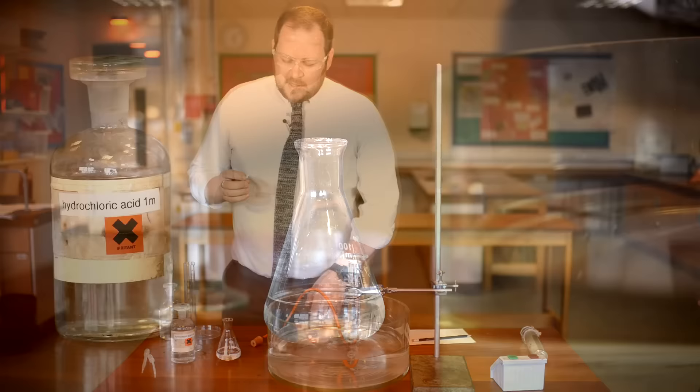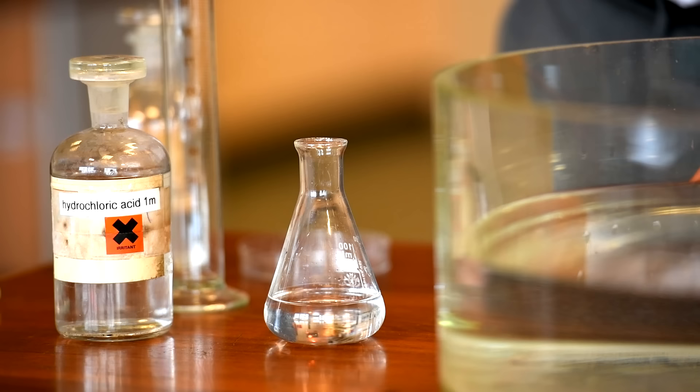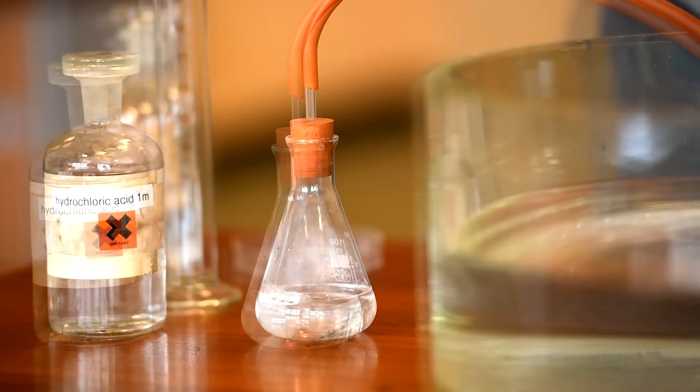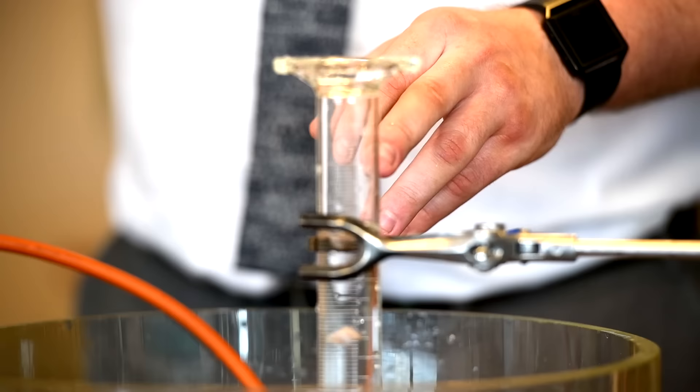You're going to add the magnesium to the conical flask and as you do this your partner is going to start the stop clock. At the same time you're going to have to put the bung immediately onto the top of the conical flask, making sure there's no room for the gas to escape. As the gas is produced, water is forced out of the measuring cylinder and you need to count how much gas has been produced every 10 seconds and record it in your results table.